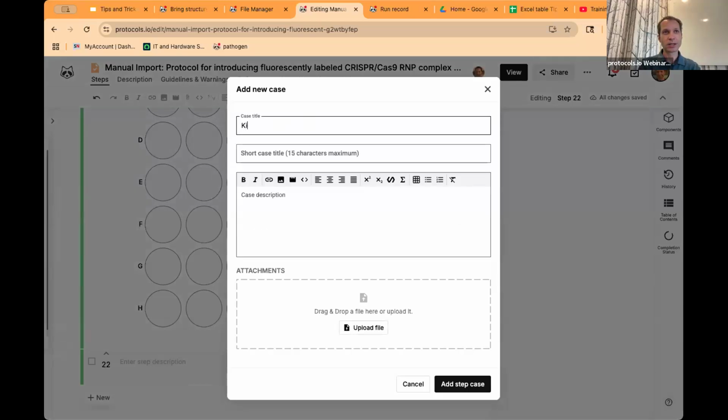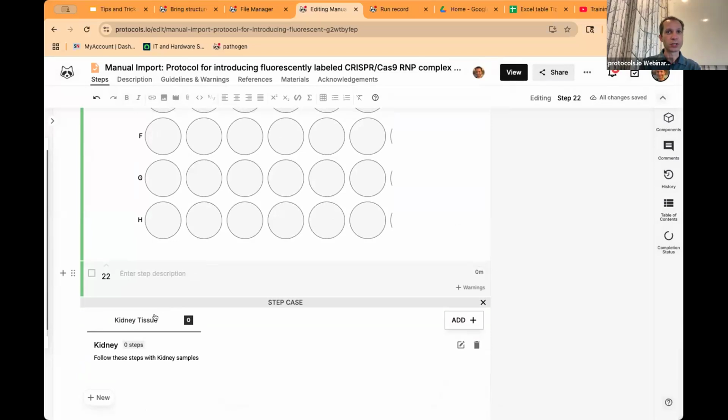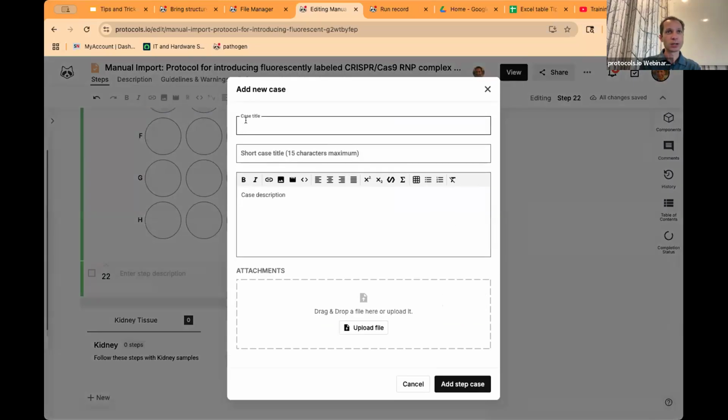So let's say this one is kidney. Okay, so right now there's just one case, and I'm going to add another one.